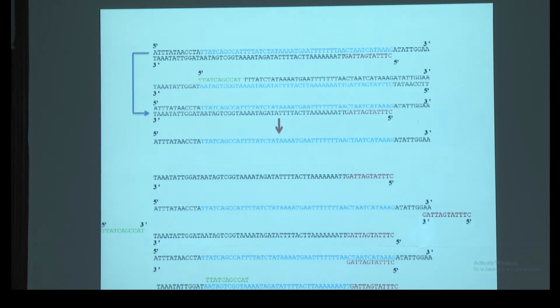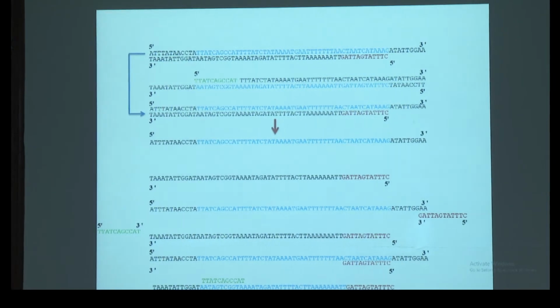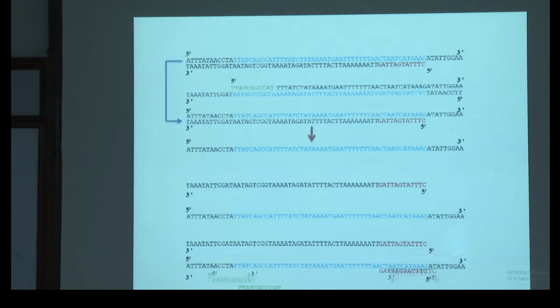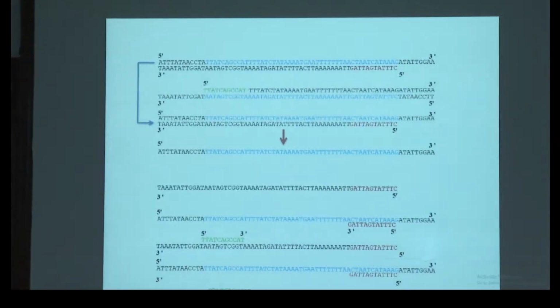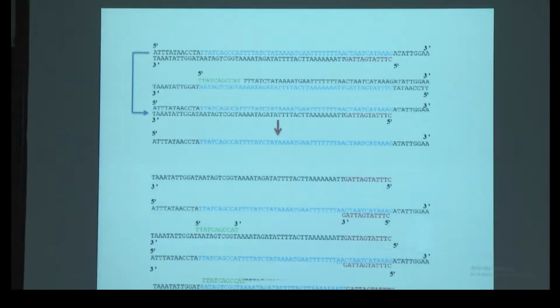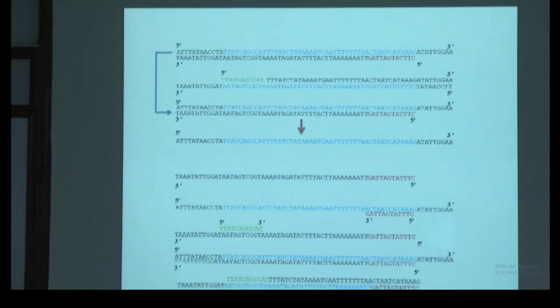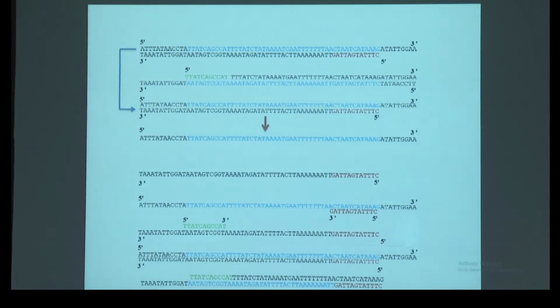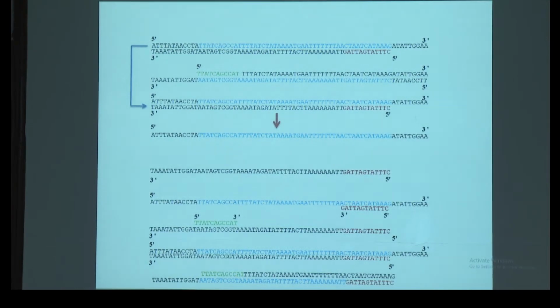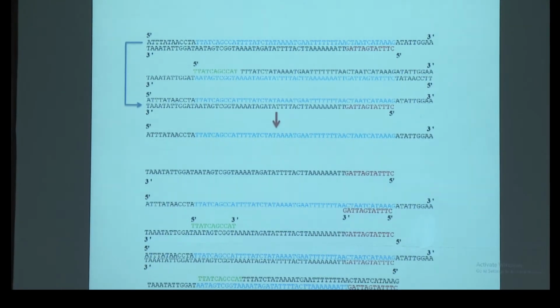Now this newly synthesized strand in the last cycle will act as an antisense. And which primer will bind the antisense? Forward primer, right? So the enzyme will sit at the 3' end of the forward primer. Now it will start synthesizing. Now you can see in the antisense it can't synthesize beyond the end of the reverse primer, which was synthesized in the first cycle. Clear?